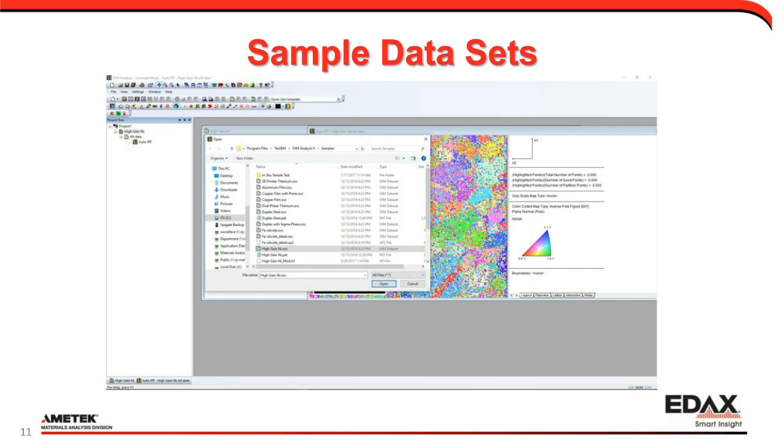With that, we're able to basically degrade a data set on purpose to start to show the power. Again, the data set itself doesn't really matter. In this case, we made it bad on purpose, but often you can do this on samples that are bad because it's just a difficult sample to get a good pattern off of. I think we all have dealt with those recently. You get those samples and everything's not a perfect metal sample, and that's what keeps my job fun. I've got a couple samples on my desk right now from a recent customer that are not going to be particularly easy, but at the same time, I know NPAR is going to be there to help me.